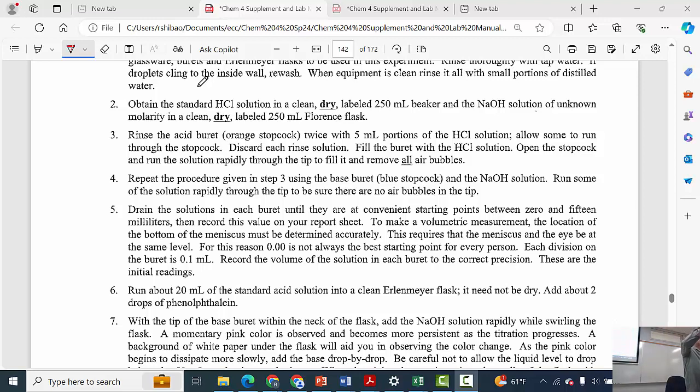The great thing about using Erlenmeyer flasks is it's easy to mix liquids in an Erlenmeyer. If I mix liquids in a beaker by swirling it like this, it's easy to splash out. But with an Erlenmeyer, you can mix it vigorously by swirling and it doesn't splash out. That's because of the tapered walls. All right, so now I have phenolphthalein and acid. Phenolphthalein and acid is colorless.